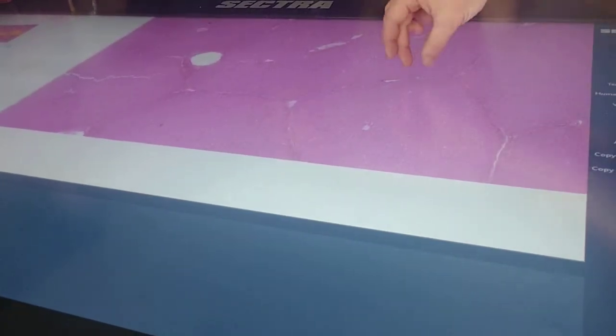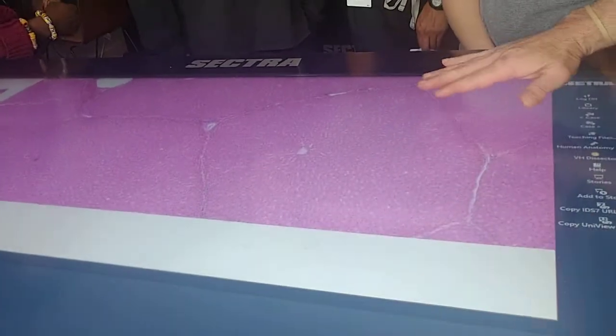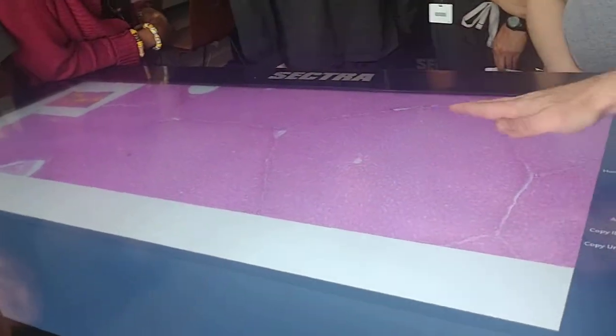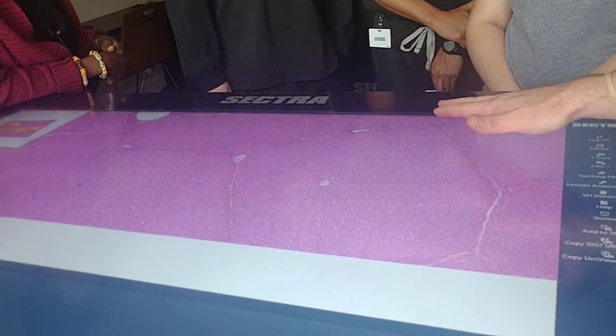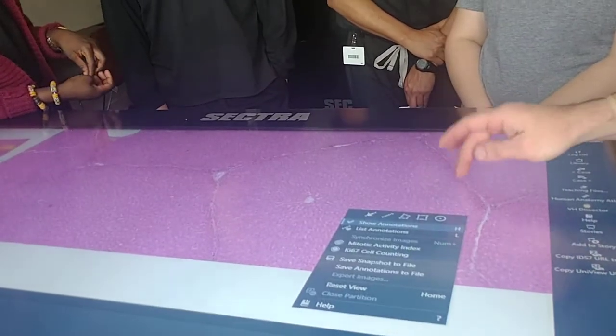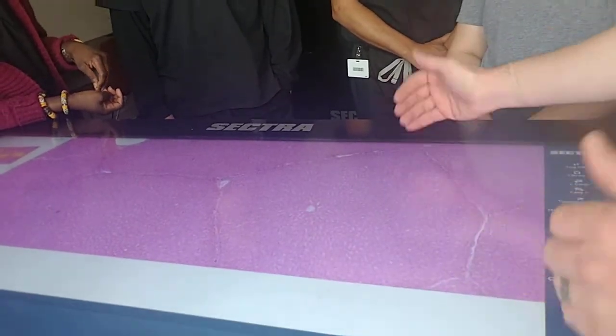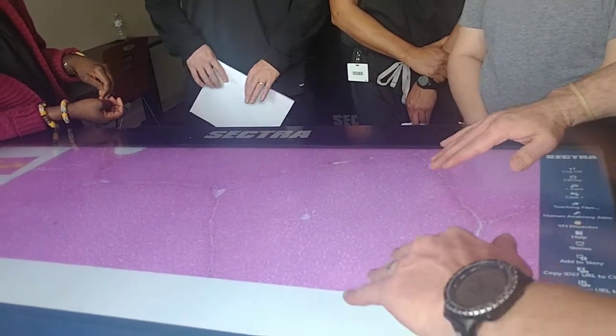But regardless, there's the hepatic portal. If you look at this, you can see all the pink cells. Those are my hepatocytes. They're going to be filtering the portal blood, and they're fed by the hepatic artery. The portal blood comes in and goes into these sinusoids. All those white lines that you see running through there are sinusoids.